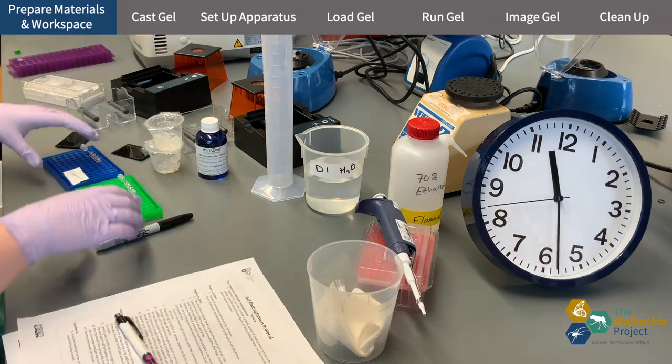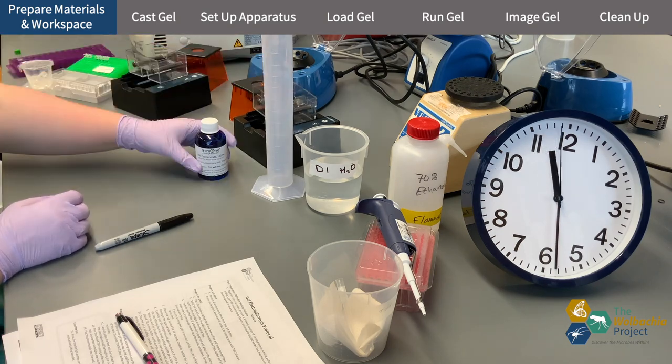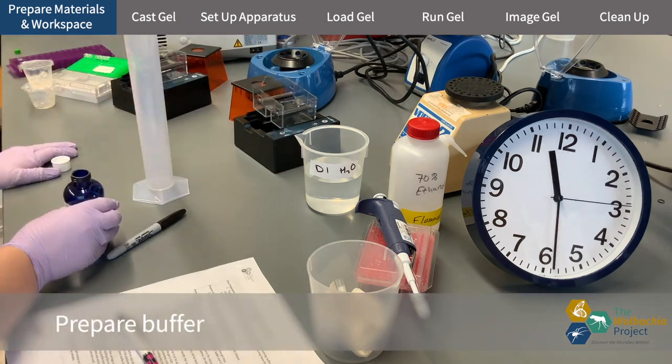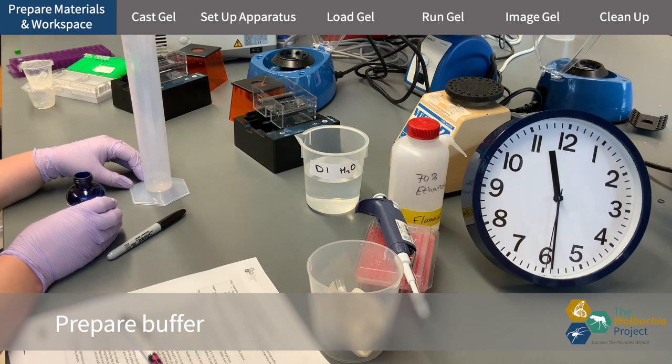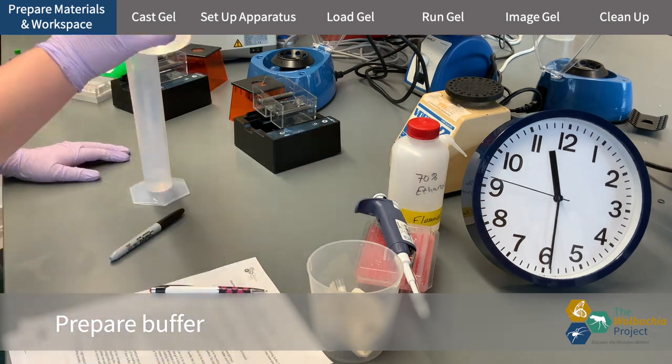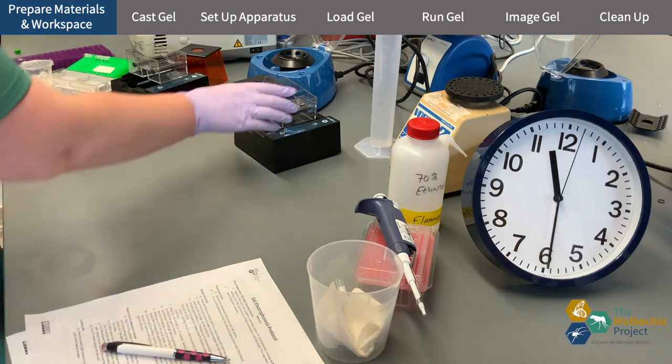Once I have everything I need I prepare the buffer. This is the same buffer that's used to make the gel. In this case I'm using Mini One's system in gel cups so I'm diluting the buffer they sent me.